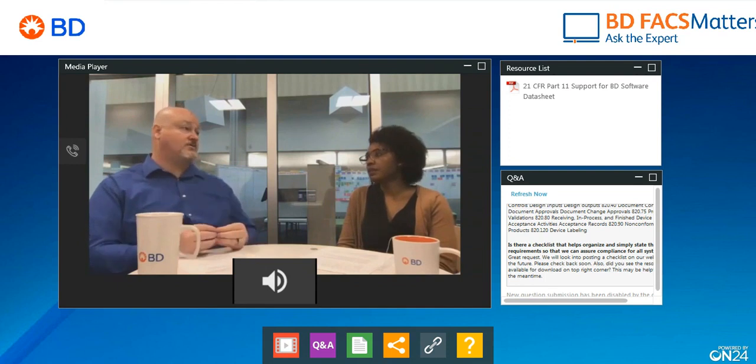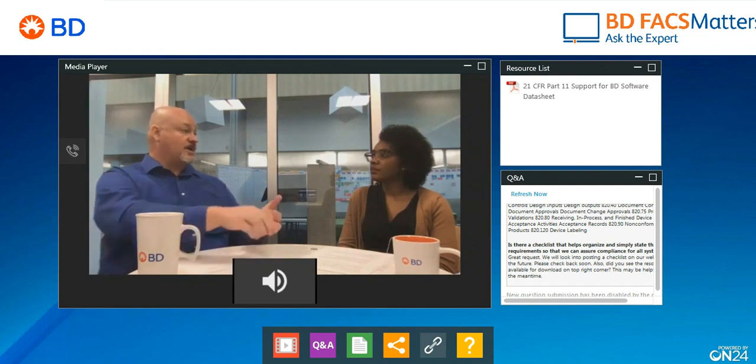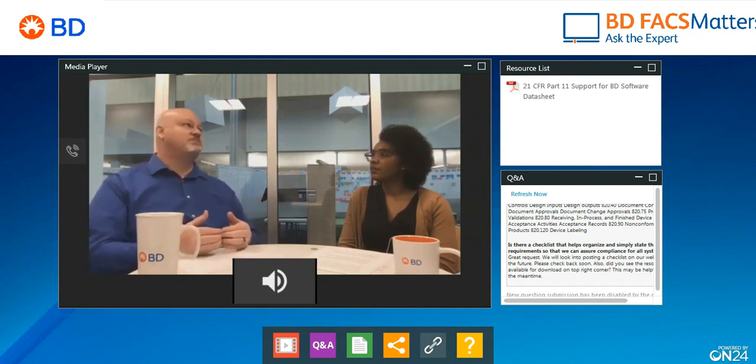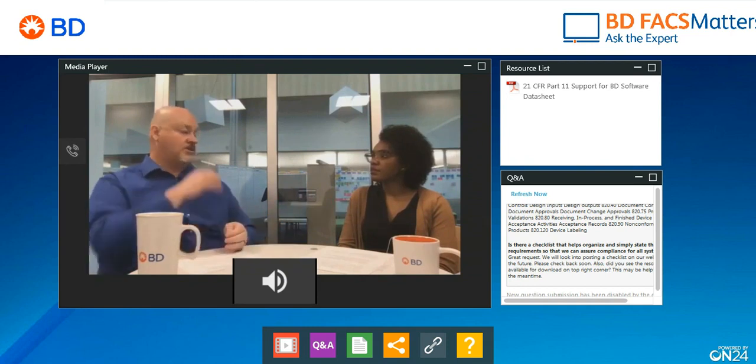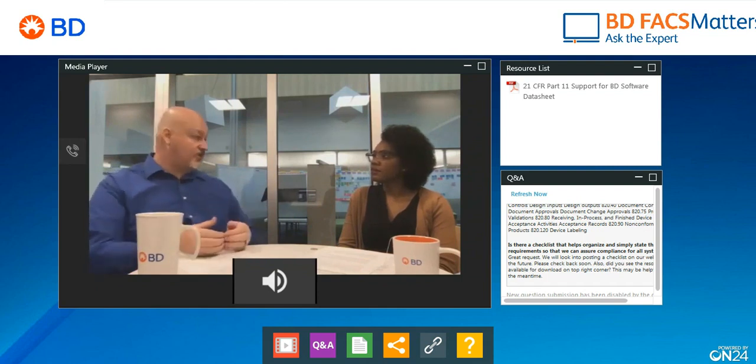Sure. So first of all, Fact Suite functionality allows you to set up users and to issue them passwords and user IDs. The user IDs have to be unique. In addition, it also allows you to set permission levels so that a user has access to do X, Y, Z. If I remember right, we could set it up so that you could have access to get to work lists, and maybe I don't have that access. And that's an important functionality that meets the Part 11 requirements.